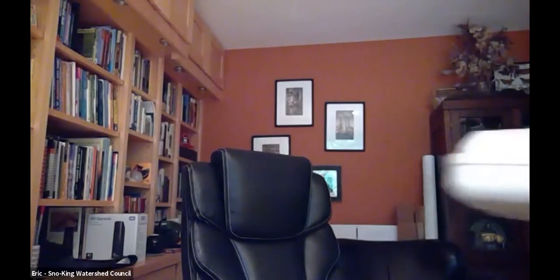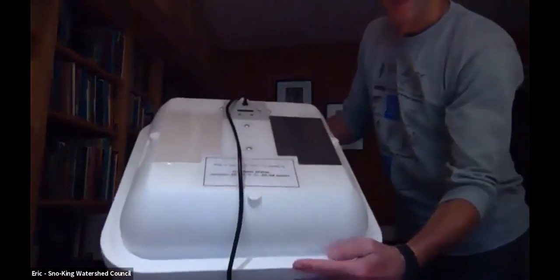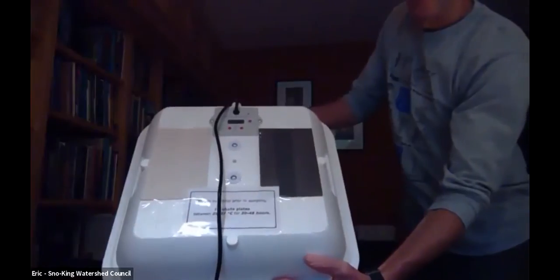And do we have more specific, well, 2 questions. First of all, do we make our own incubators, or do you provide them? So we provide the incubators, and actually, hang on a second, I've got one right here. So the incubator that we use looks like this.